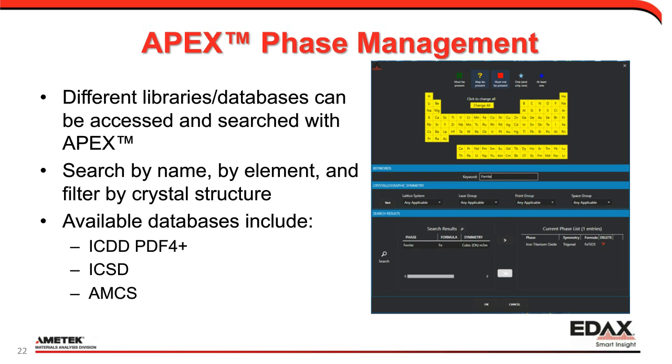In addition to the database that's supplied with EDAX, we can access other third-party databases, including the ICDD PDF4 database, the ICSD Inorganic Crystal Structure Database, and the AMCS American Mineralogist Crystal Structure Database. Those extend the capability into basically all the crystal structures that are used for, say, X-ray diffraction pattern matching.